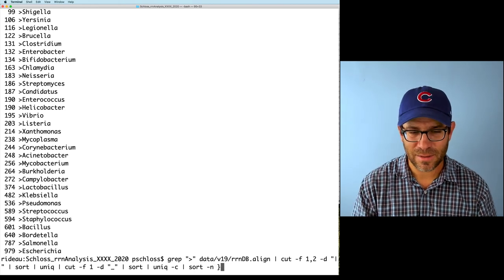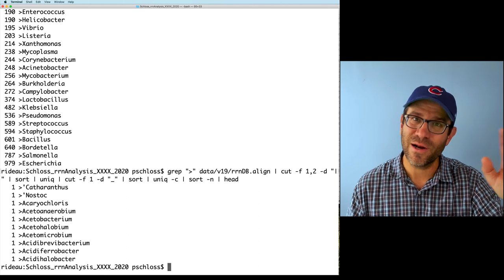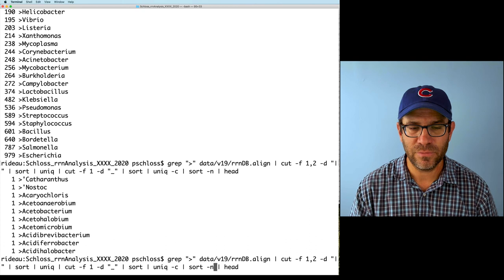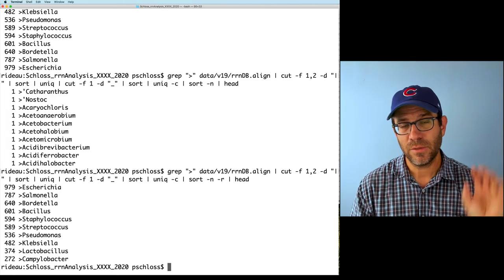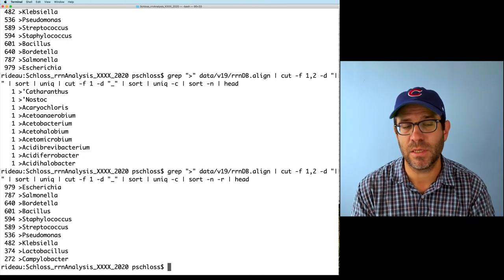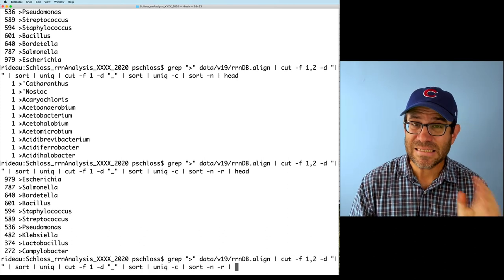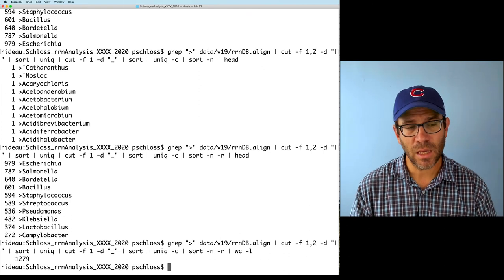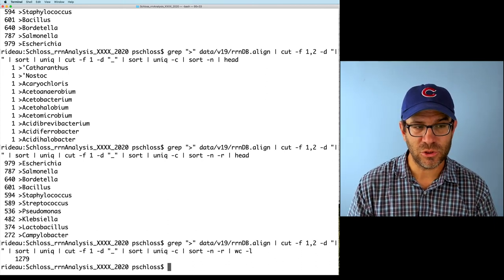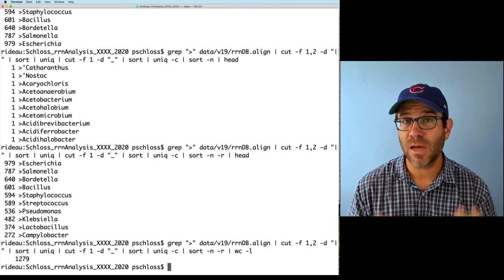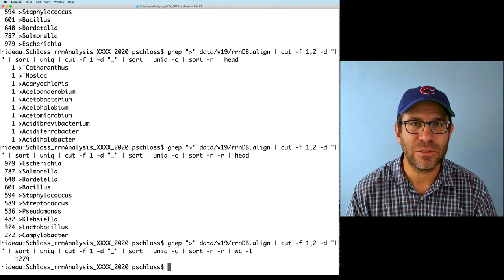Piping everything to wc -l shows us that there are about 1,279 different genera represented in the database, with 979 Escherichia genomes being the most common. This only goes to show that our genome sequencing is still heavily biased toward clinical isolates and pathogens.